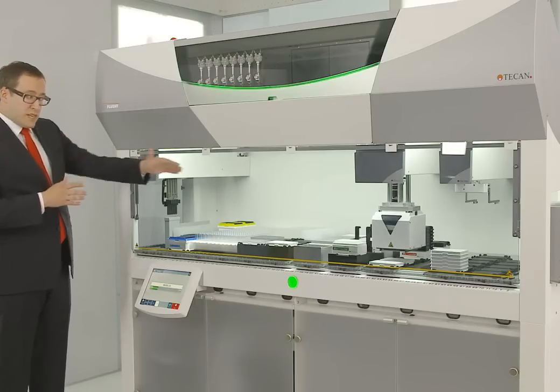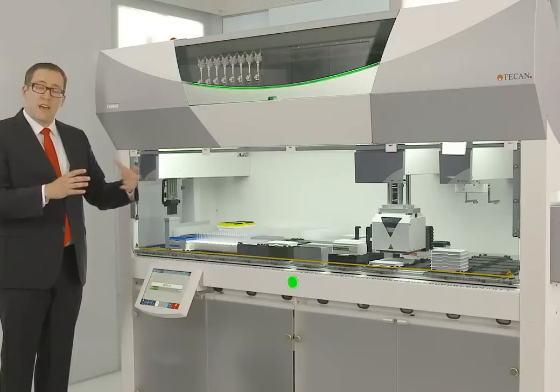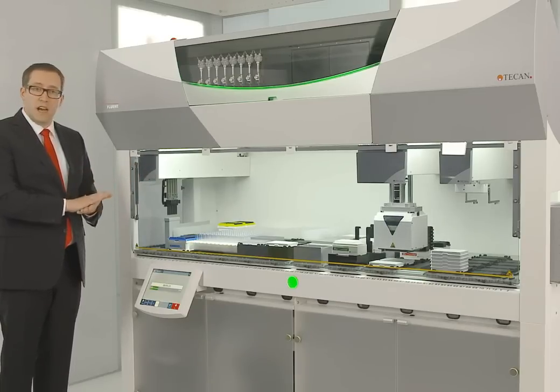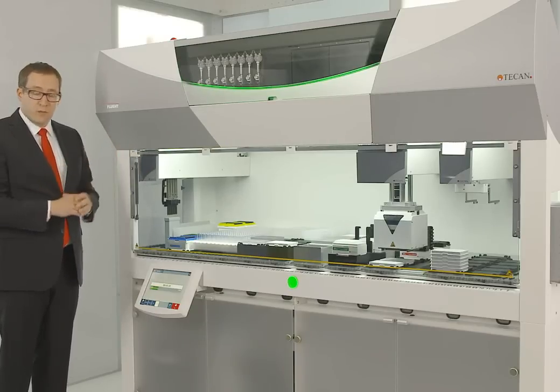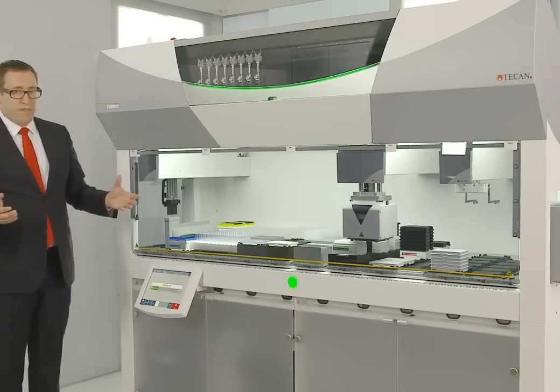The software knows that it's in front of that tip stack next to the active carrier, that there are these high objects around it, and that it can move without any risk of collision. So the software is actually keeping an eye on the work table conditions even as they change. As the tips get used, it will know that there's more free room to move around the work table. We'll put those tips back and actually show off my favorite arm on the system.